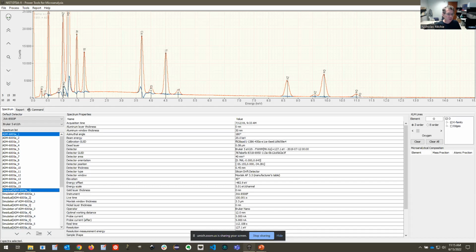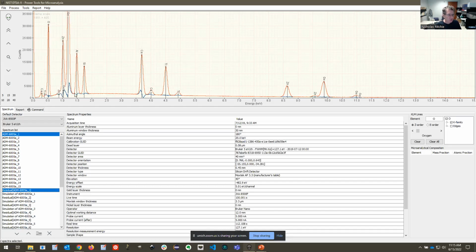And then at lower energies, we often see structure down here. Part of that's because there's just edge structure, meaning that there are absorption edges in the continuum. And that's what we're seeing here. Part of it is also because of chemical effects.